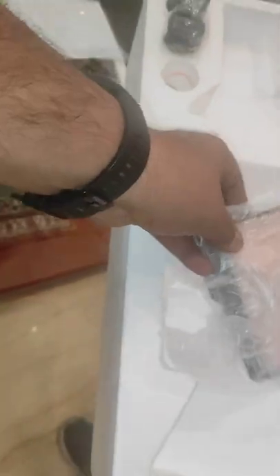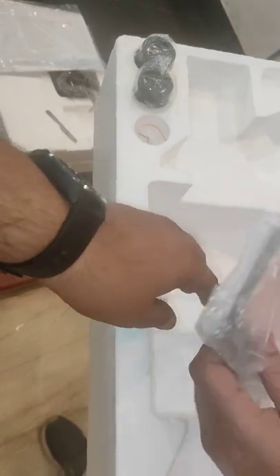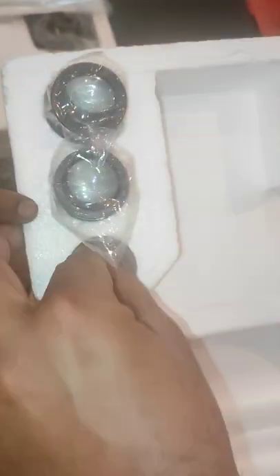Eye piece. Face shield — the face shield. And you got the Allen key in there — Allen key.